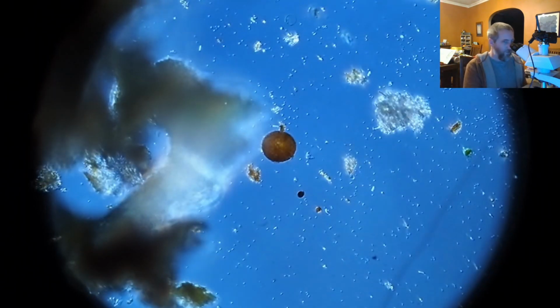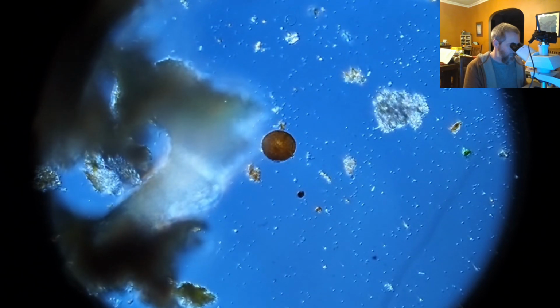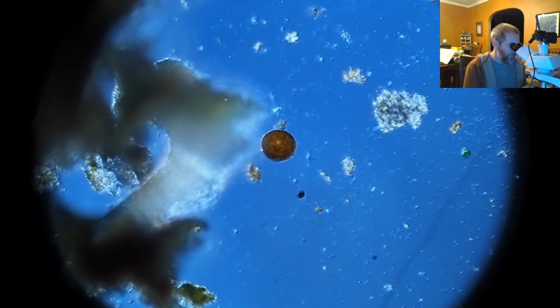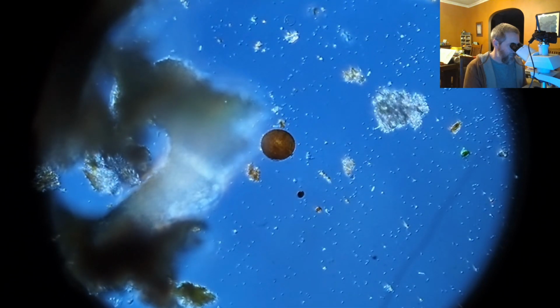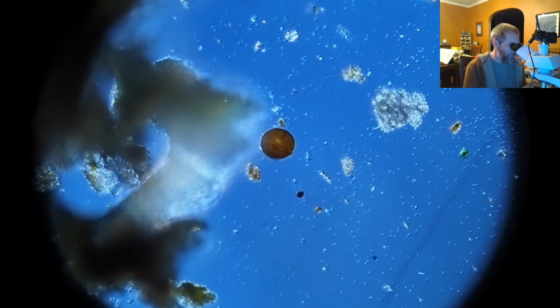That brown thing right there is Arcella. That's a type of testate amoeba. And I don't know if it's actually living or not. I'm probably a little too far out to tell. Sometimes when they're living, you can actually see the little pseudopods sticking out, and they start sort of crawling around. But that little brown thing right there is actually an Arcella. That's a type of testate amoeba.